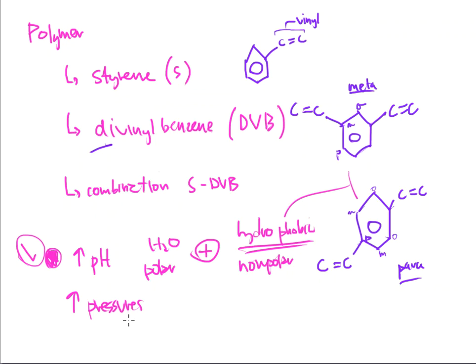And that's good news for me, because I cannot have a stationary phase that's going to change shape over the course of time just because it cannot withstand the high pressure that my system is giving it. All right? So let's take a look at this styrene and divinyl benzene structure a little bit more. I've got a picture I need to show you.